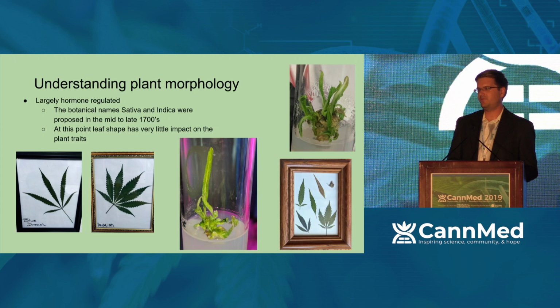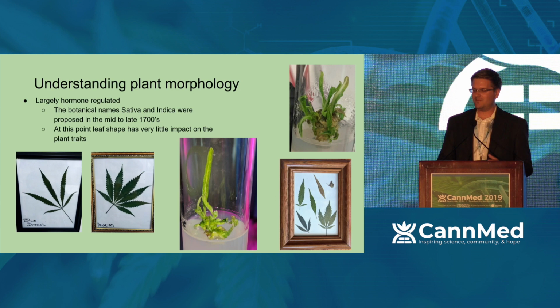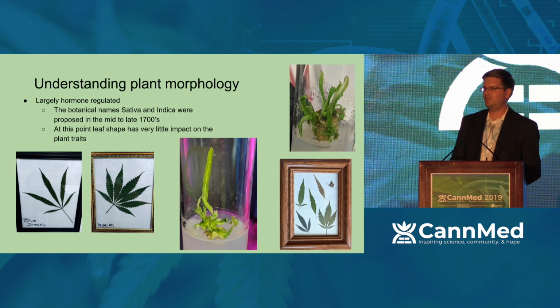The other thing that I did was I tried a couple different hormone blends that were unconventional, and as you can see in some of these pictures here, they'll produce elongated leaves or just weird genetic issues that are all environmental based. So it's epigenetic stress changes rather than actual gene changes themselves. Once you culture that plant again and again, it will revert back to the state that it normally was at.